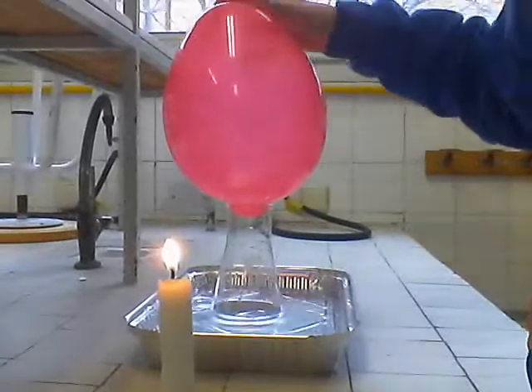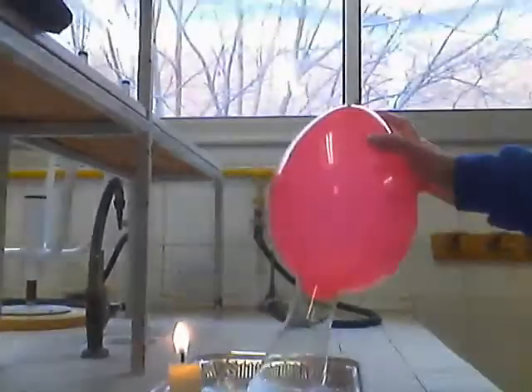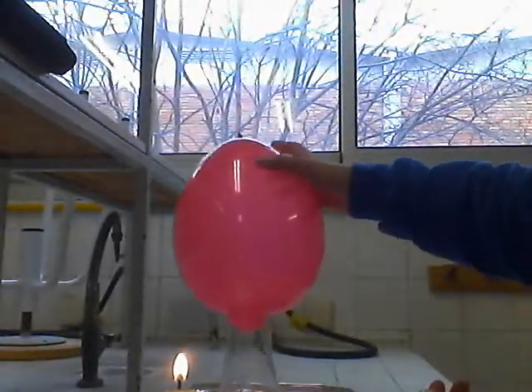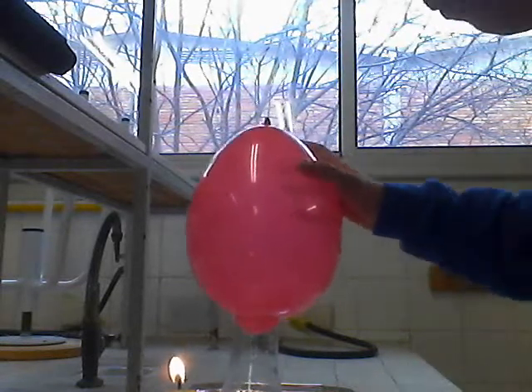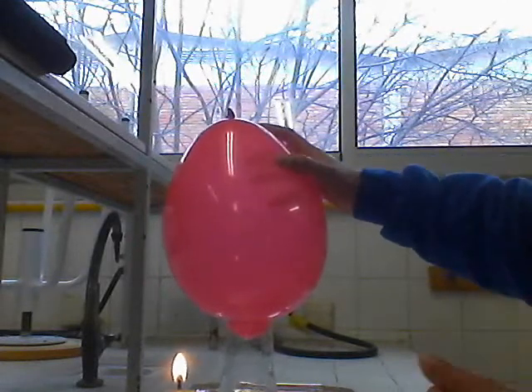Com hem vist, hem utilitzat un globus, una safata on hem posat una mica d'aigua, un vas a precipitats i, finalment, una espelma. Us prego que vosaltres ho feu a la vostra casa.